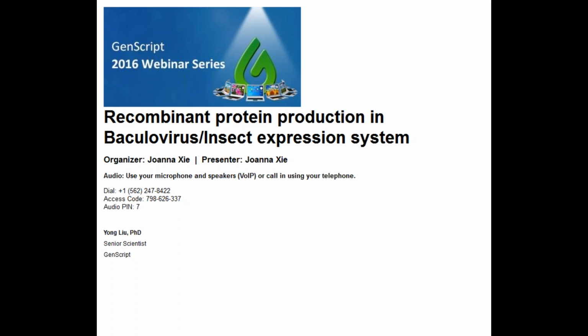And so this can also be an efficient way to express and purify proteins that are part of a larger complex. So, optimization for expression. What expression conditions can we optimize?